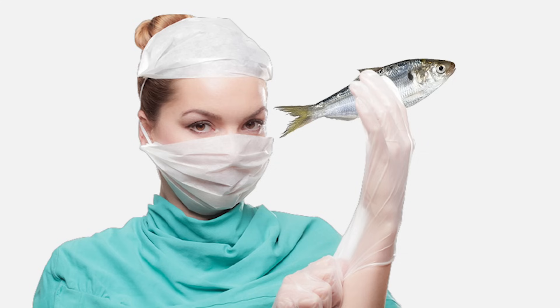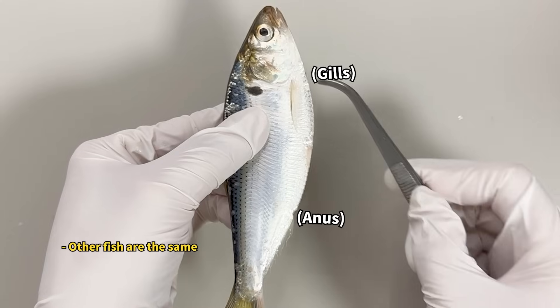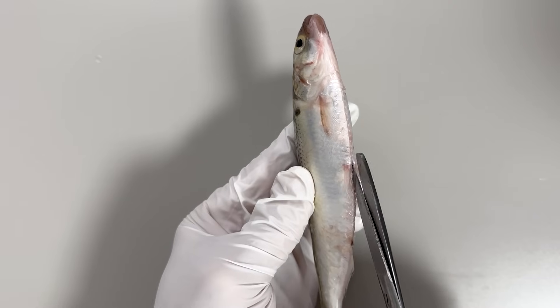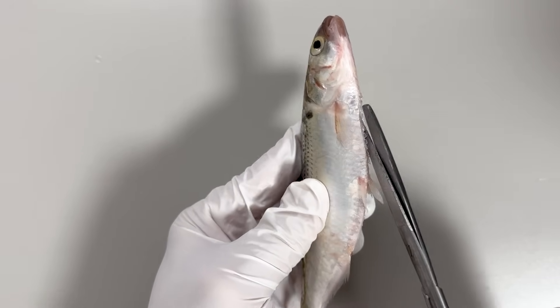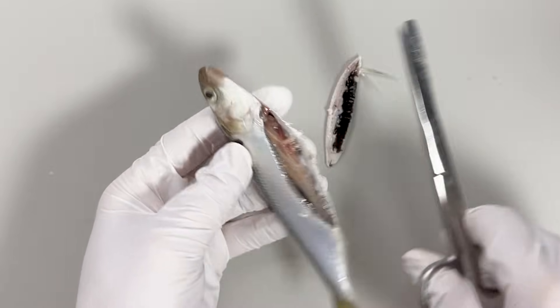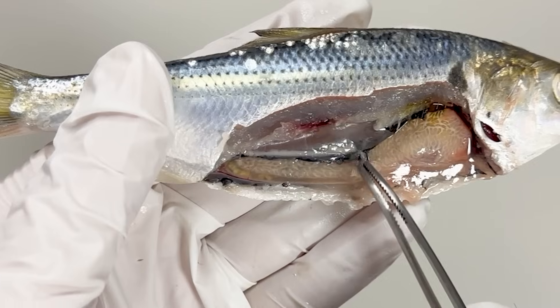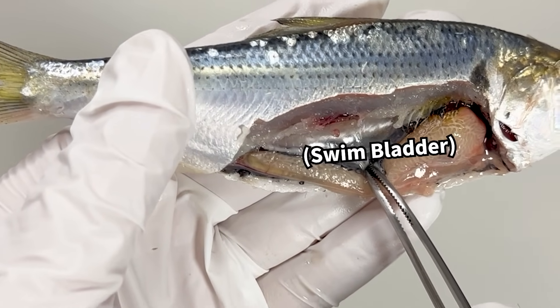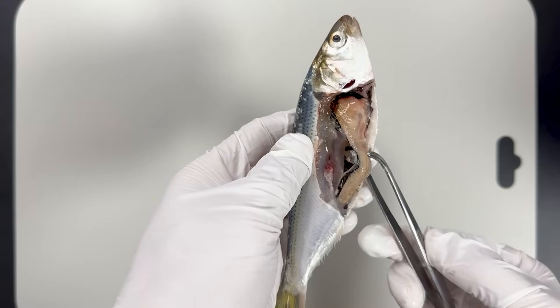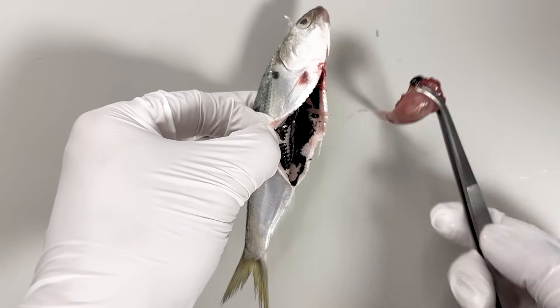I will now dissect the Gizzard Shad and show you exactly what it is. If you turn it over, here is the anus, and the internal organs are situated between the anus and the gills. So if you cut from the anus to the gills and open it up, you can then see the internal organs. Removing the lateral muscles makes them easier to observe. If you look at the upper part here, you can see a pouch inflated like a balloon. This is the swim bladder, responsible for regulating buoyancy in the water. The lower part contains the digestive organs, which can be cleanly removed by pulling.